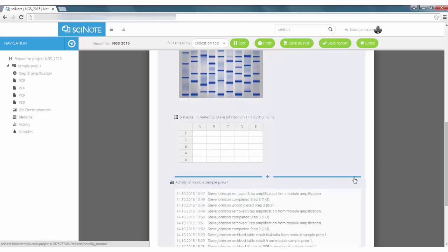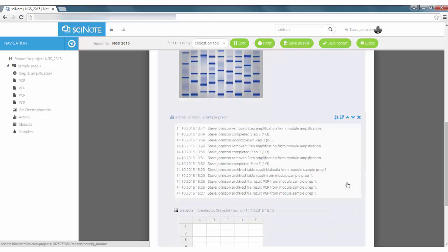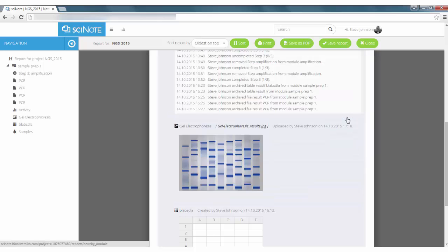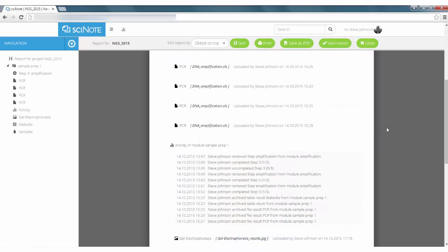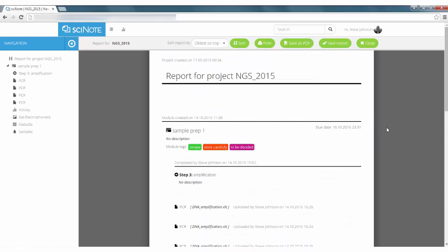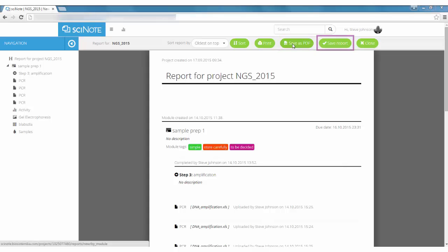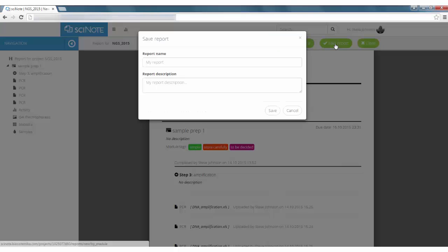You can also rearrange the content as you wish. Download report on your computer as a PDF file or save it in SciNote to review and modify it later.